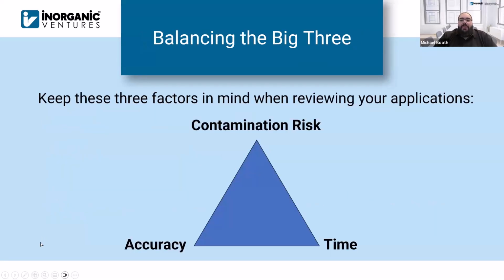So we will sit down with folks if they have a question about what standard is right for them. And in those conversations, I typically keep these three factors in mind. First off is, we talk a lot about contamination. It's one of our most popular topics that we review when we do either our ICP conference or seminar appearances. Everyone loves to talk about contamination risk. So that is something to keep in mind. Like I mentioned before, if you're doing high dilution factors, even a very small trace amount of contamination can appear to be very large after you've applied your dilution factor.